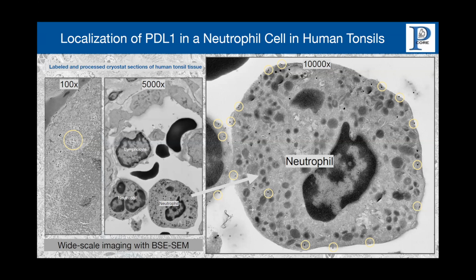And we also know that PD-L1 can be internalized, and therefore I'm not surprised that we also see some PD-L1 particles in the inside of the cell. So having this protocol, we now use this to further investigate all PD-L1 positive cells in tonsils. And with this, I'm at the end of my talk.